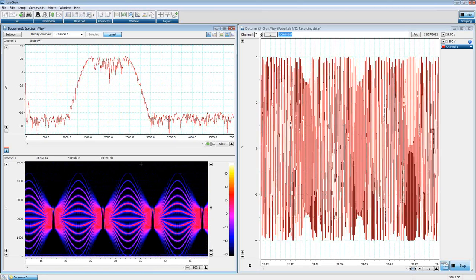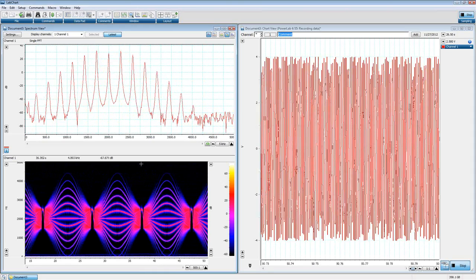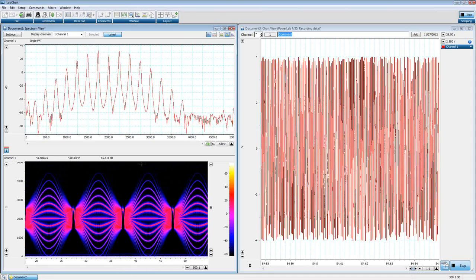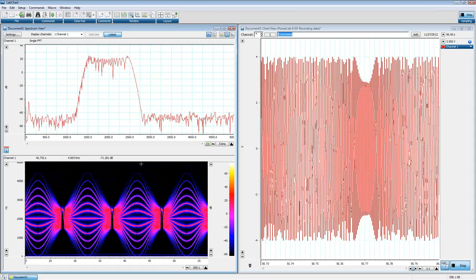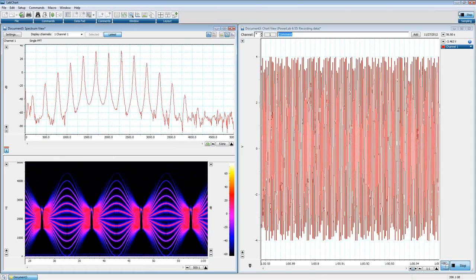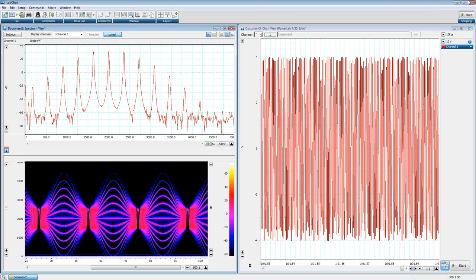So very powerful feature with the stimulator. You can do a lot of things with it, and the addition of this customization with the arithmetic functions adds a whole other level to it. So I would highly recommend that you experiment with it, give it a try. Like the slides you can kind of see here, the sky is almost the limit as far as what you can do with it. So that kind of brings us to the end of all the topics that I wanted to cover.